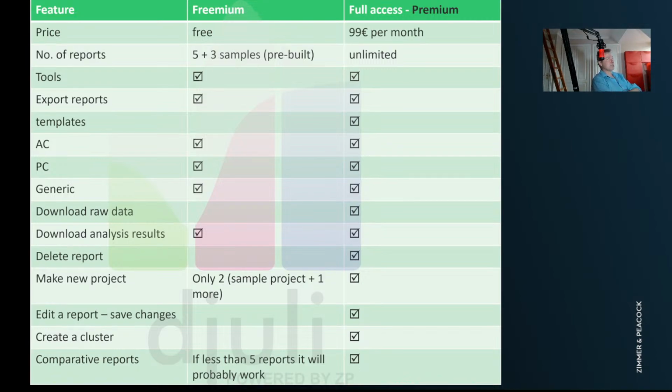That means you could use it in part as a data transfer system. Not that you need that, with things like Dropbox, OneDrive, Google Drive, but it does mean that somebody in the lab uploads some data, and later on you want to analyze that data in some third-party system like Python code. Then you can download the data as well. Obviously, the analysis reports can be downloaded anywhere.